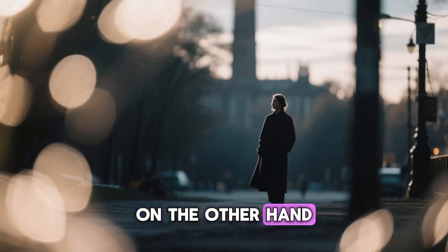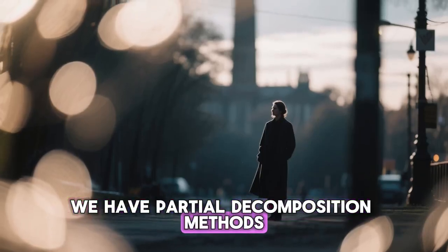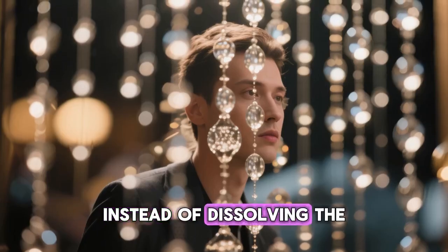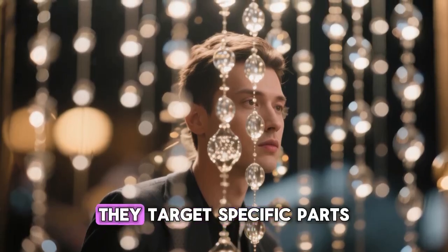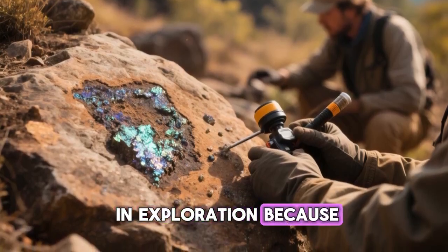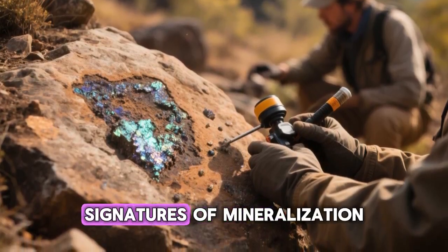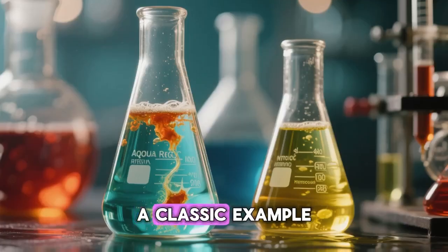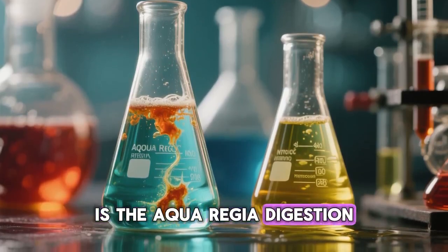On the other hand, we have partial decomposition methods, or a weak attack. These are more selective. Instead of dissolving the entire sample, they target specific parts. This is very common in exploration because we are often looking for signatures of mineralization rather than the total amount of an element. A classic example is the aqua regia digestion.